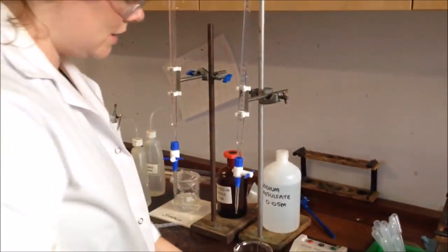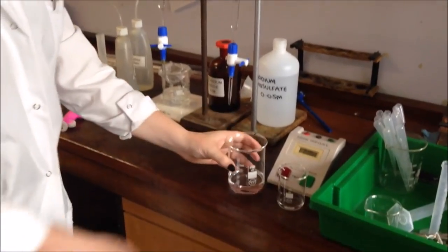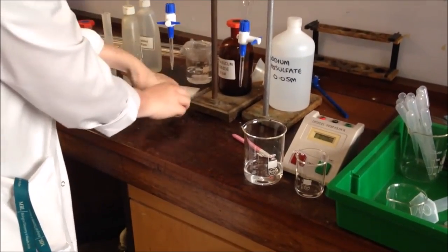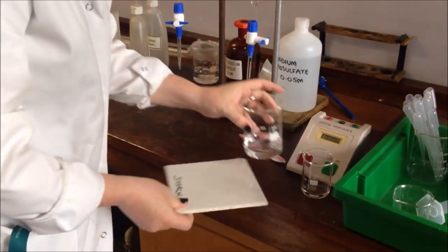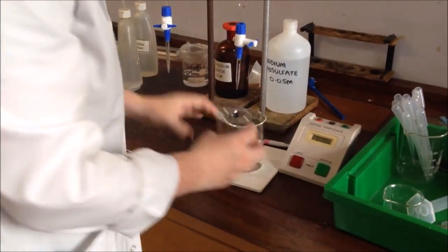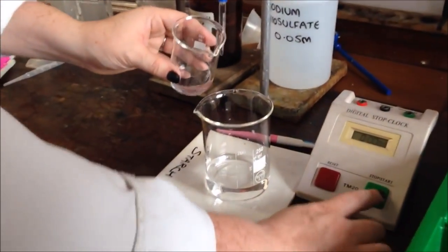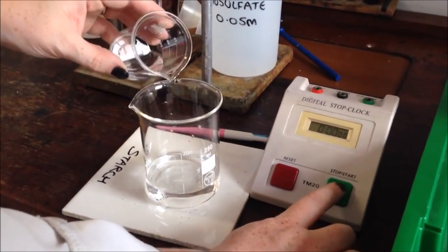Now I have my solution here, I have my hydrogen peroxide here. What I'm going to do—I'm going to do this on a white tile so you can see it a bit clearer—is mix the two of them, and we are looking for the time taken for a colour change. So as soon as I'm mixing, I'm pressing start.